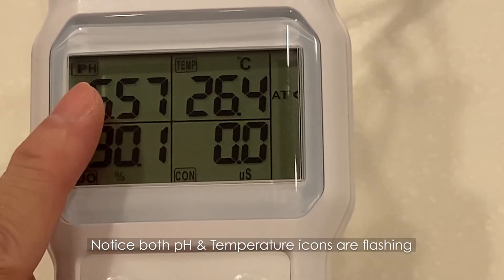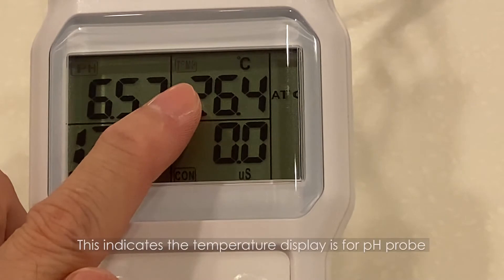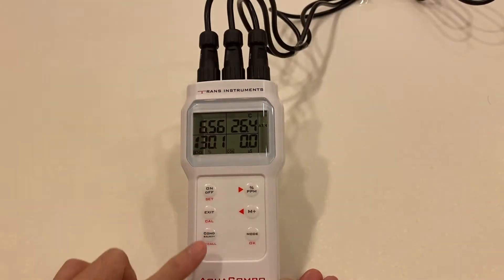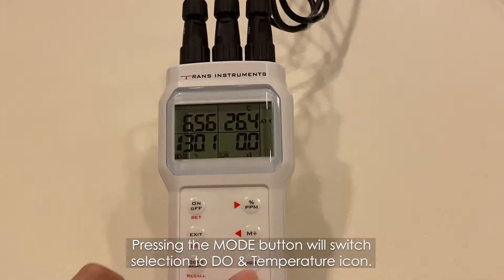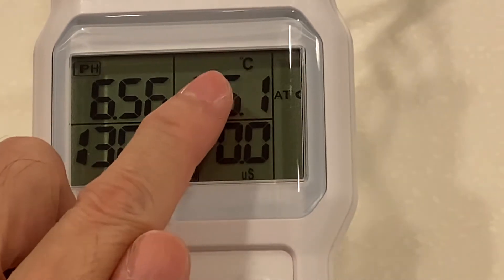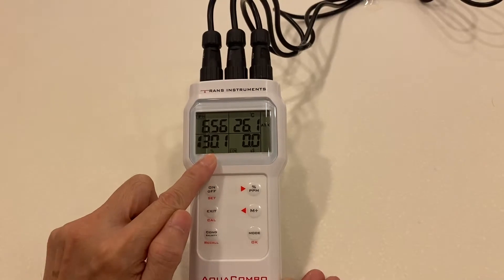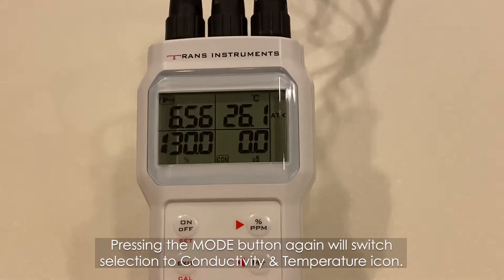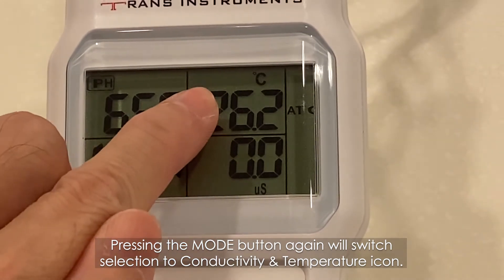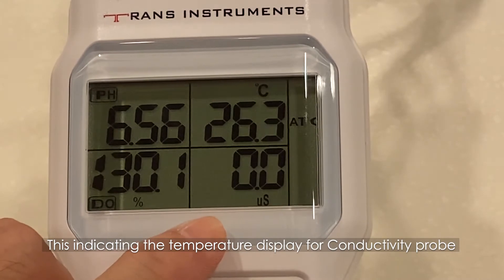Notice both the pH and temperature icons are flashing, indicating the temperature display is for the pH probe. Pressing the Mode button will switch the selection to the DO and temperature icon, indicating the temperature display is for the DO probe. Pressing the Mode button again will switch the selection to the conductivity and temperature icon, indicating the temperature display is for the conductivity probe.